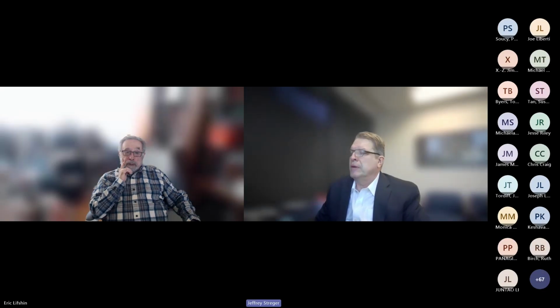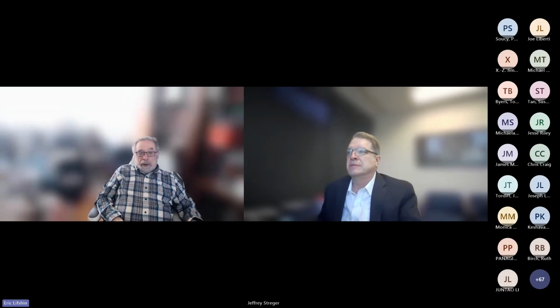Okay, great. All right, thank you. Okay, so Annette Vanderhunt has a question. Are there particular challenges from an EDS detector perspective from radiation in the analysis of nuclear materials by EDS?